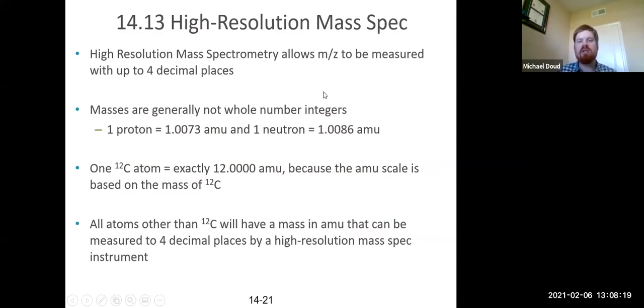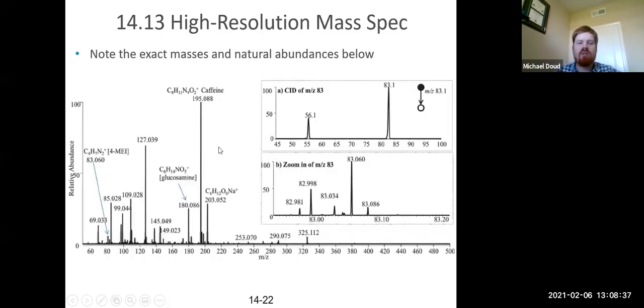Okay, so again, sometimes it's not good enough to have a low-res mass spectrometer. Sometimes you need high-res mass spectrometry. Basically, it uses a more sensitive detector, and it determines the mass to charge ratio up to 4 or 5 decimal places. This is what that looks like. You'll notice there are more significant digits, and that way you can be more specific about which molecule it is. The more you narrow down that number, the fewer possible combinations of atoms can fit that number, so the more sure you can be about that molecule's existence.